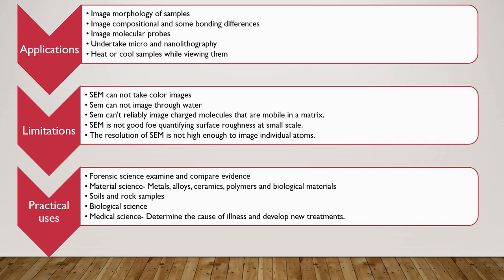Next is applications, limitations and practical uses. First of all, we will see the applications. Scanning electron microscopy is a remarkably versatile technique. There are many different types of SEMs available for specific needs.